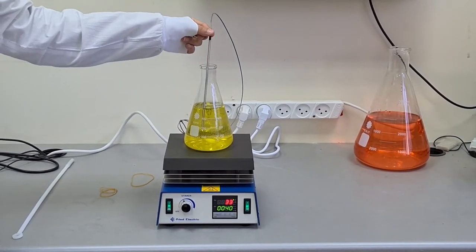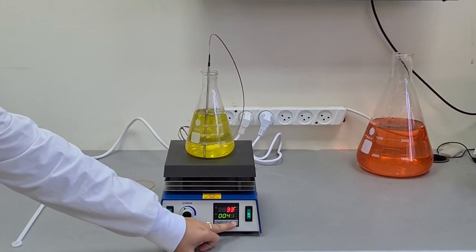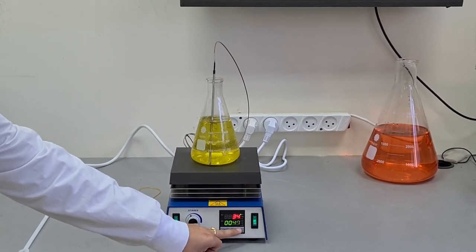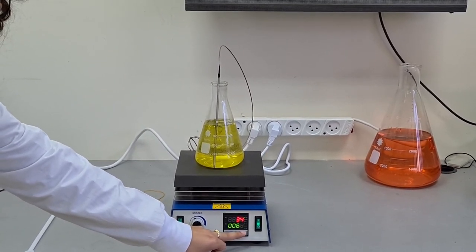The temperature is getting higher, you can see here. We can determine the temperature.